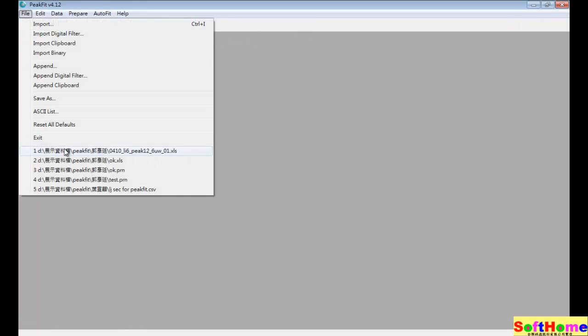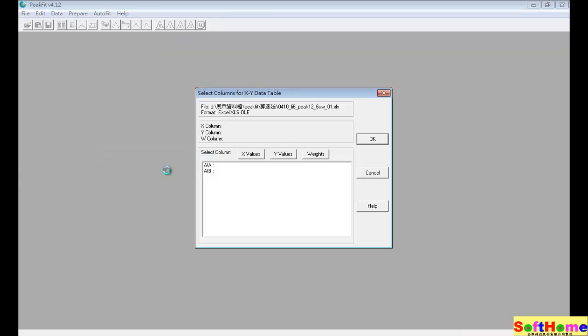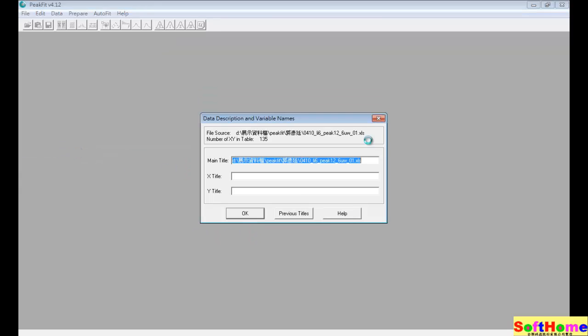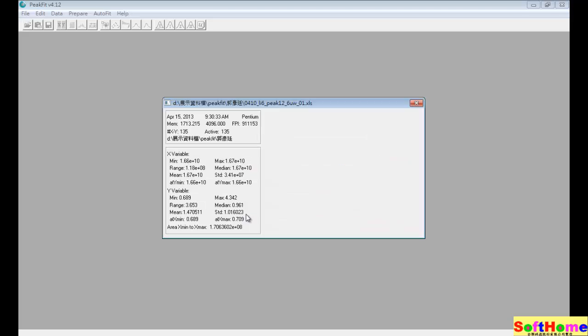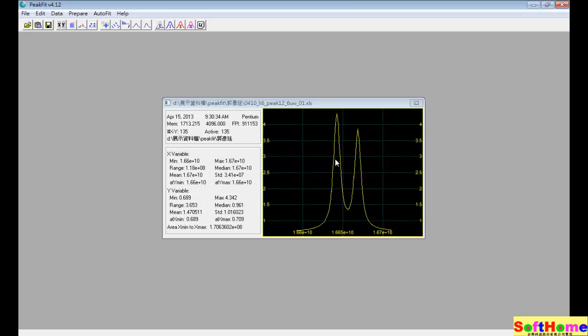How to fine-tune the parameter. First, we enter the customer's data. And why? They have two peaks.